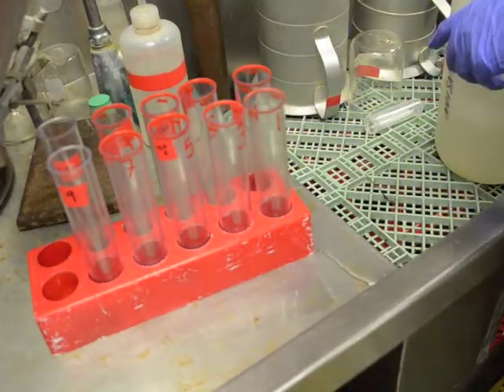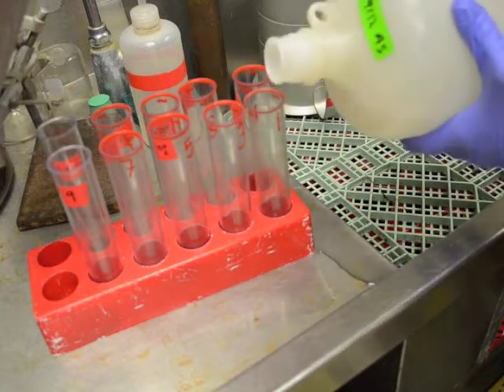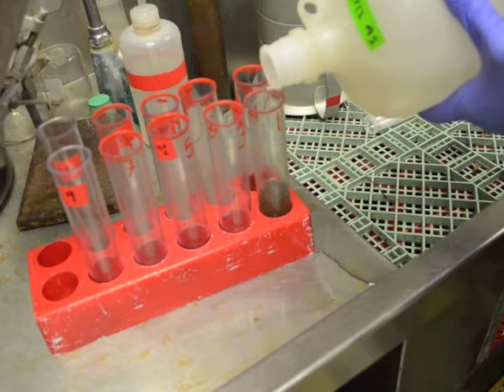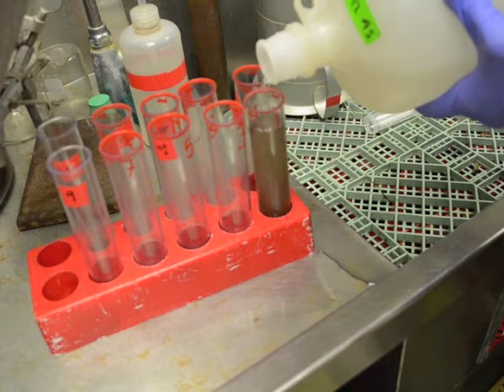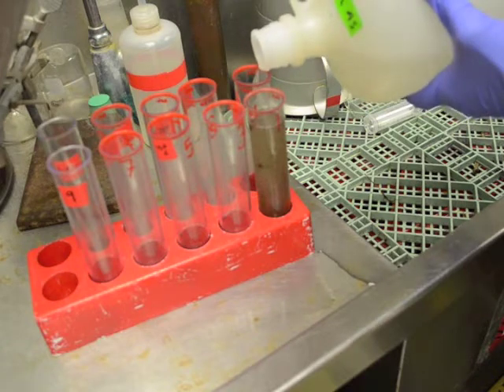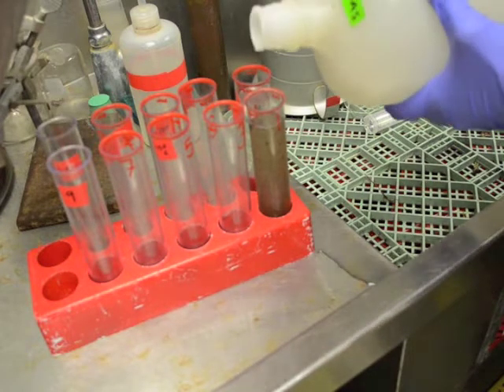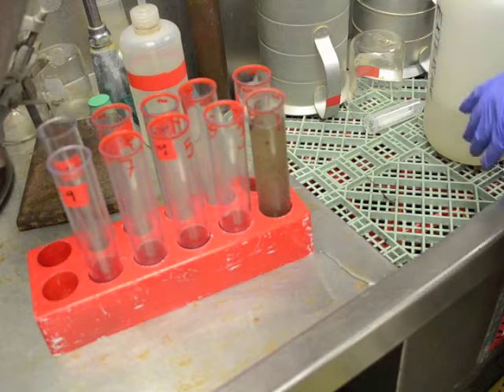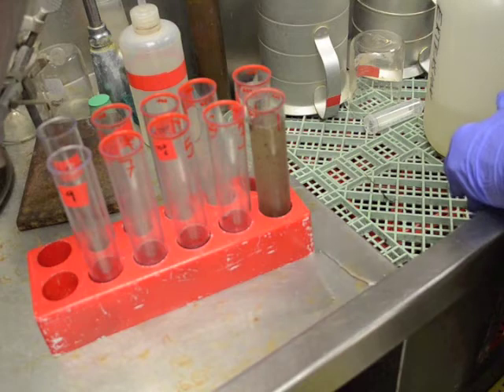Next, add the sucrose solution to the centrifuge tube. Mix the sample in the sucrose solution thoroughly.